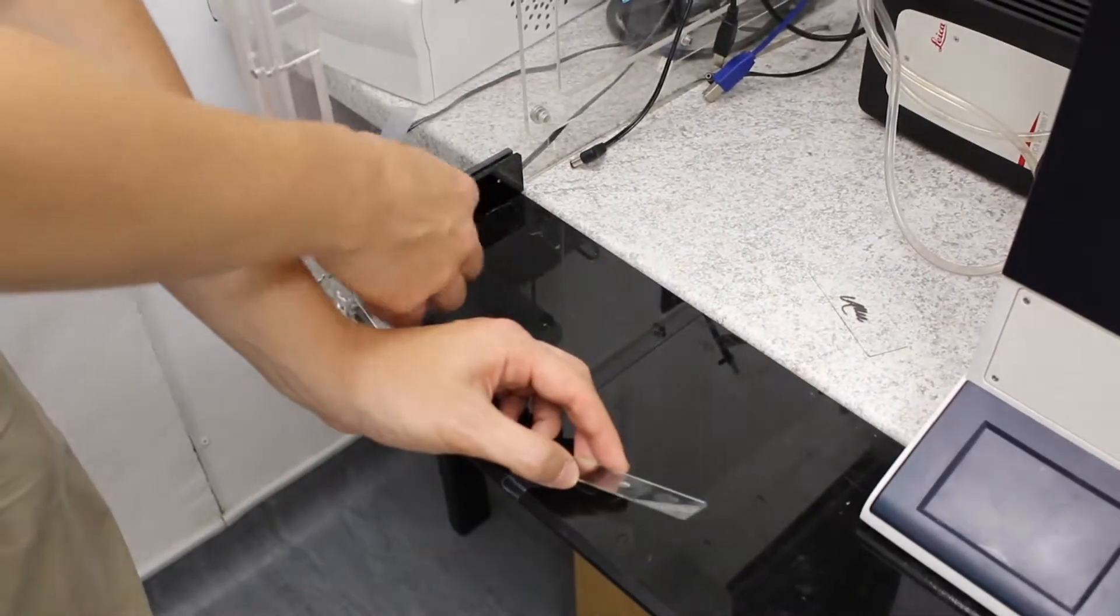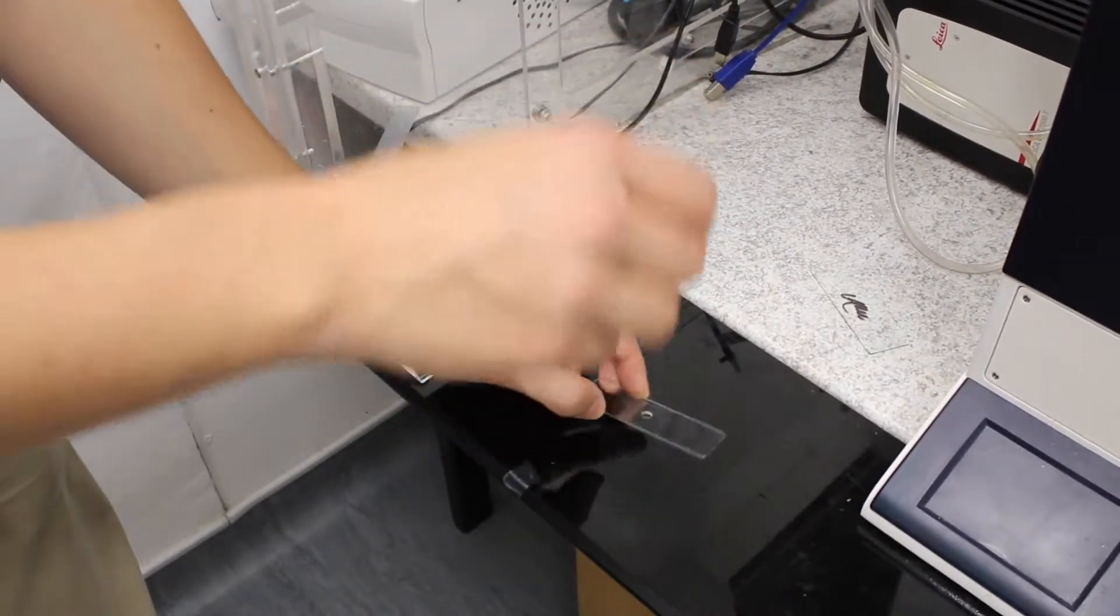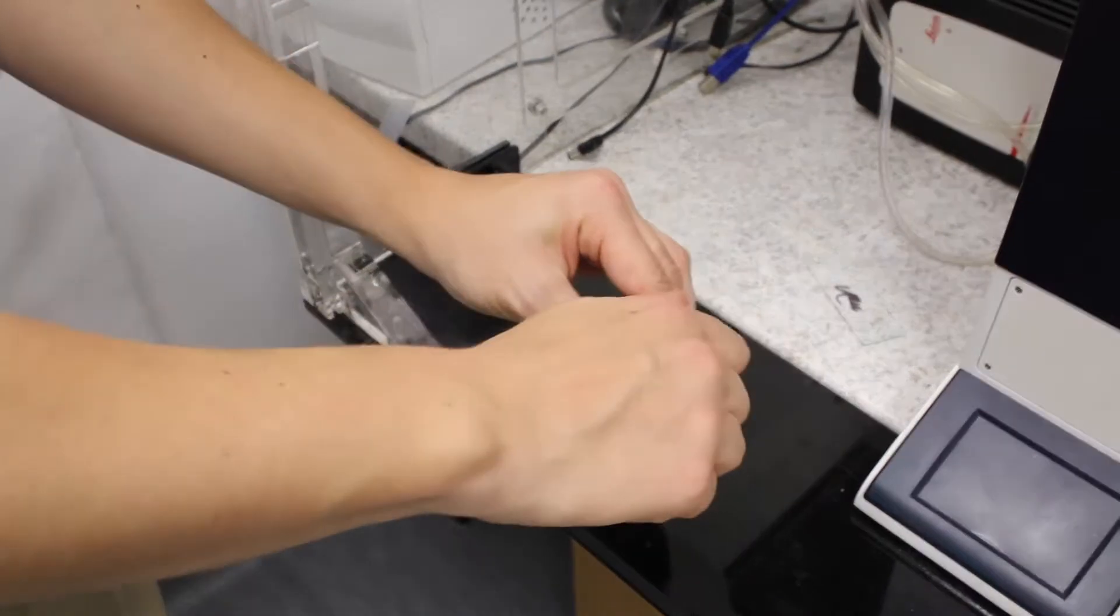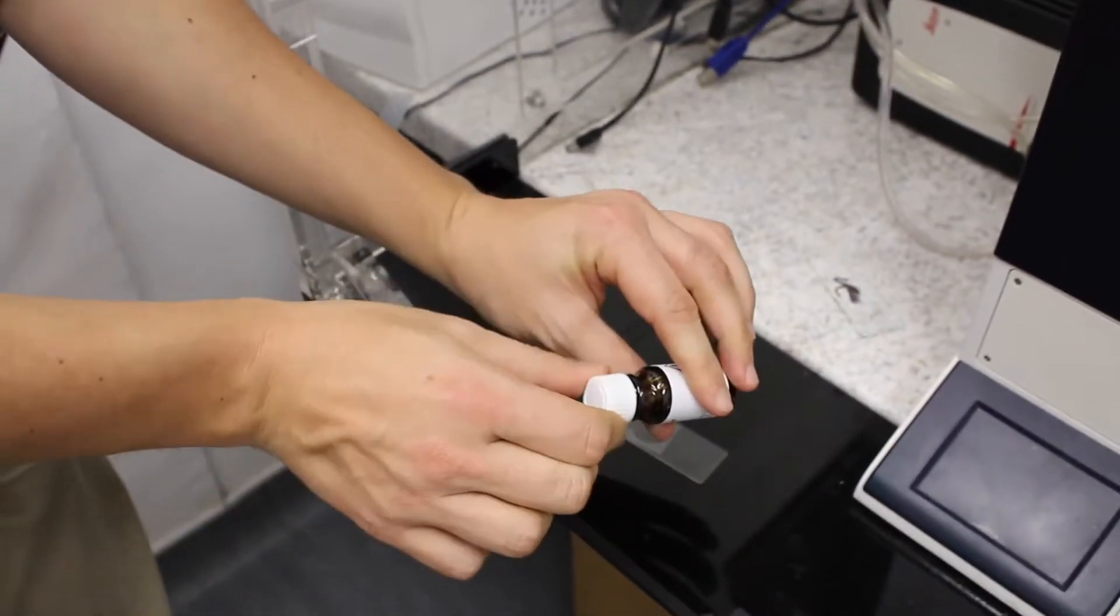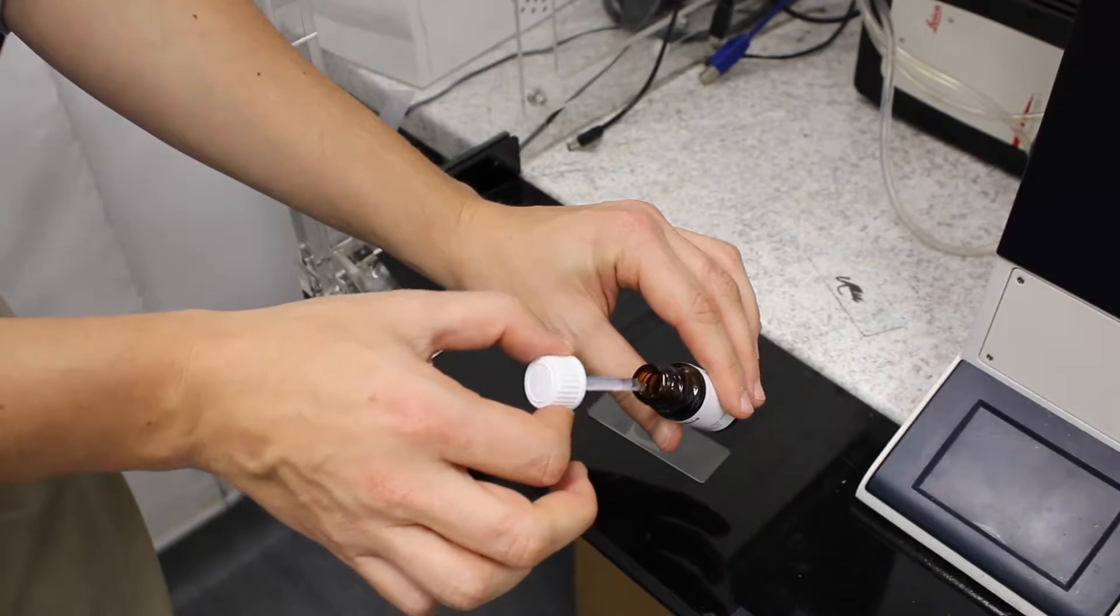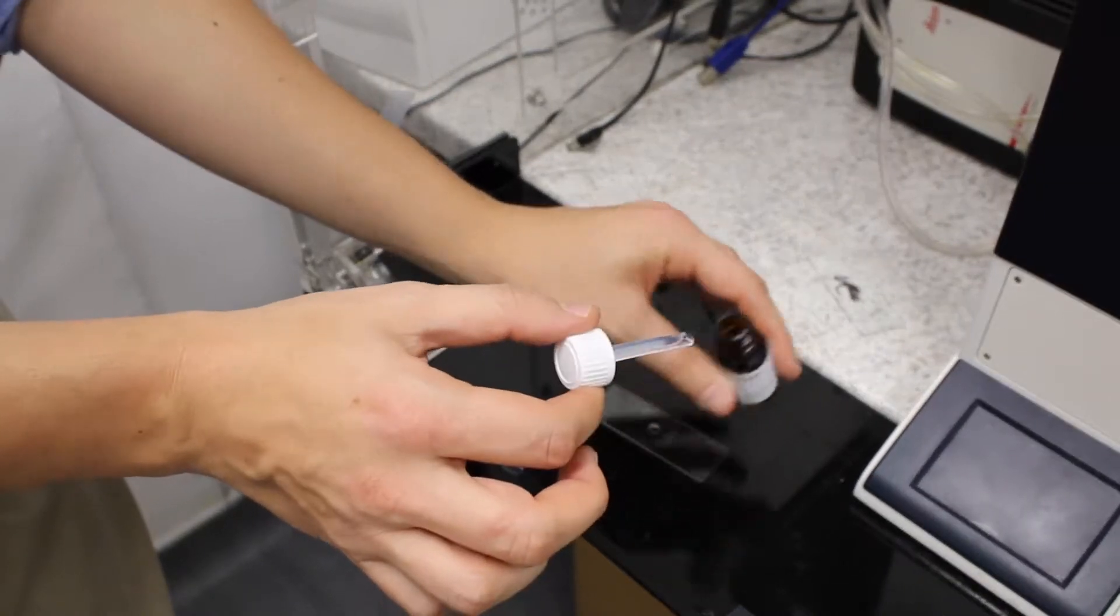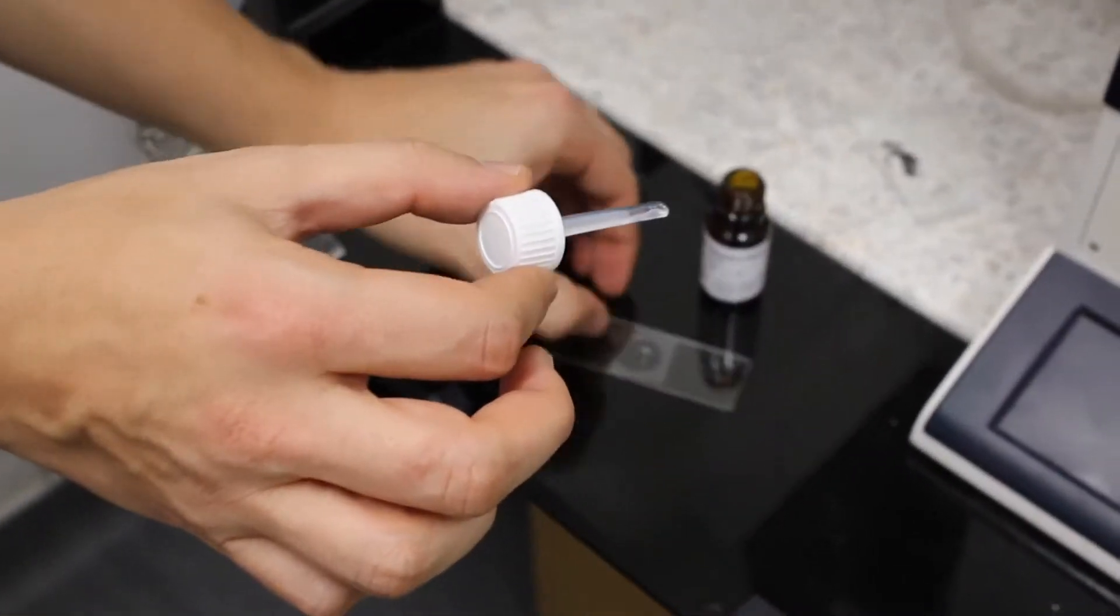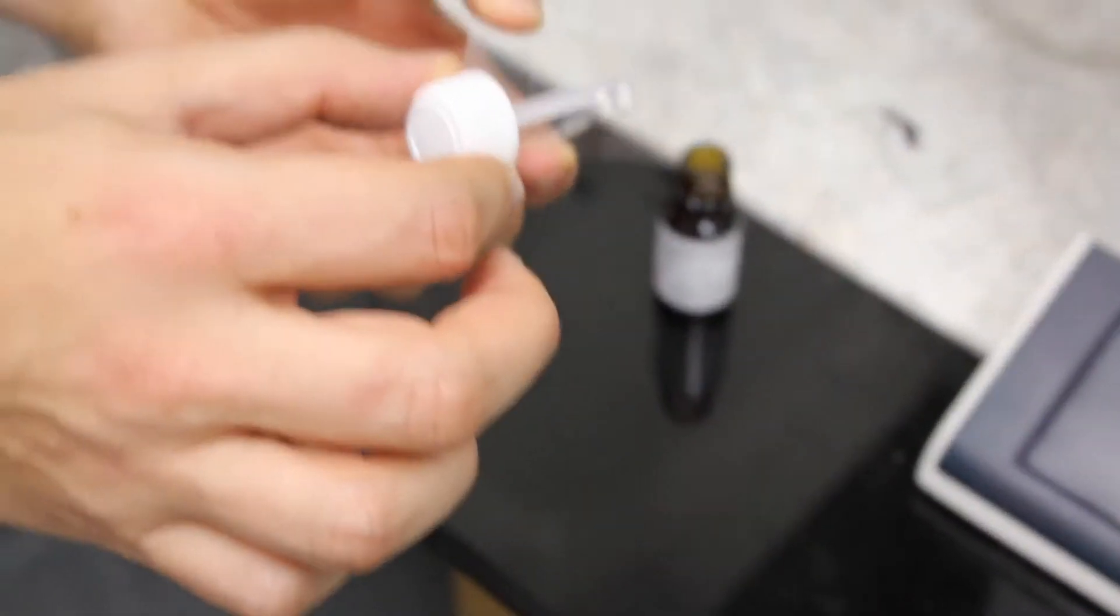So the oil is usually located here in this corner, it's in this box. So you just take it out, and you just take a small drop of oil, and you put that on the coverslip.